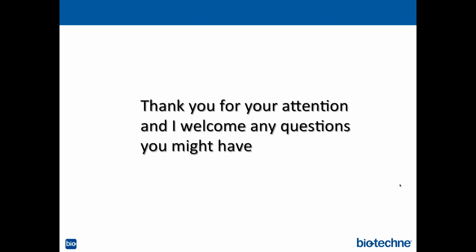Oh, hi. Yes. I just want to know how is the glycosylation of all the clones? Are they the same or different? Will they affect your affinity or something like that? I'm sorry, could you repeat the question? The glycosylation on the antibody. Are they all the same, or do they have different glycosylation? Because some scientists argue glycosylation is very important for the antibodies.